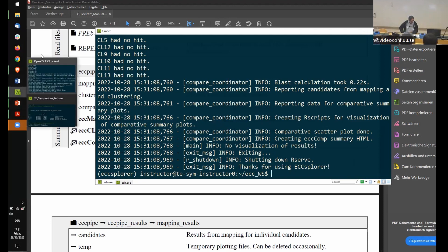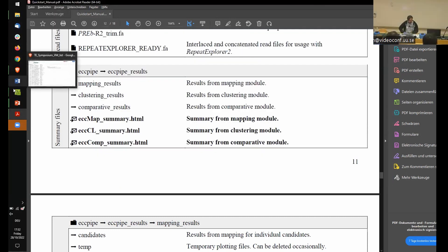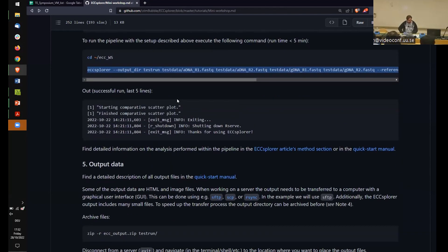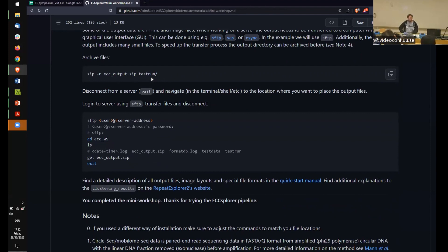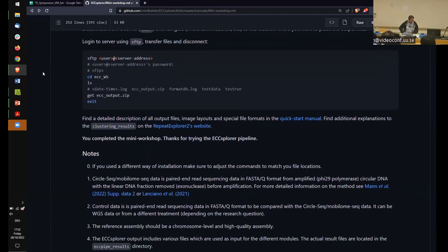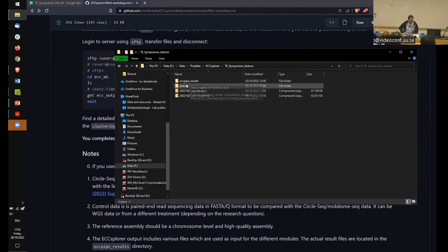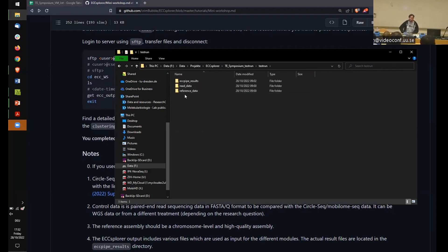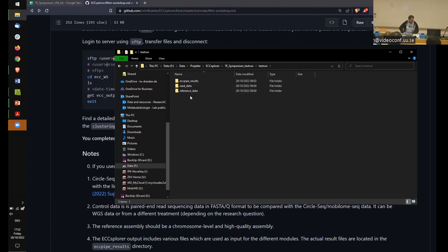The next step is to get the data back from the server — I'll briefly mention this since the VMs won't be available much longer after the meeting. You can zip your 'test_run' folder and transfer it via SFTP to look at the results on your own machine. The test run will have three folders: input data (read data and reference data), which is stored so you know exactly what went into the pipeline — though you can usually delete it.